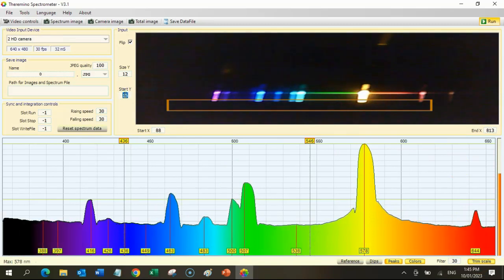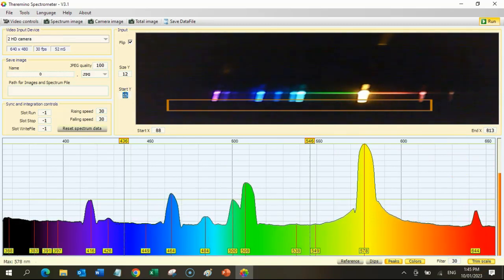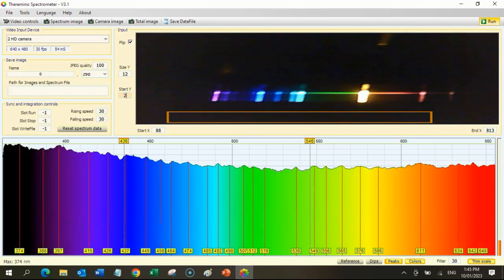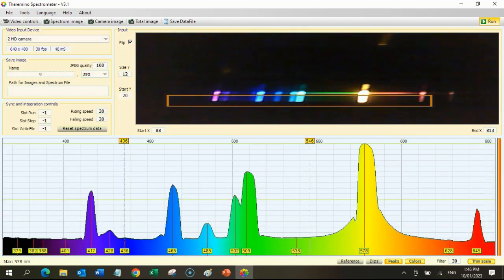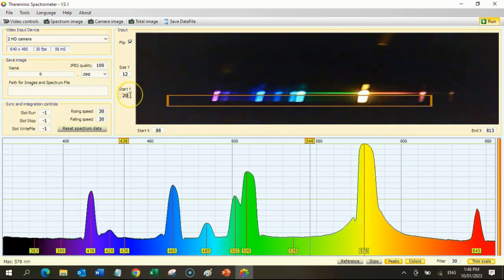Then point the spectrometer at different light sources and draw the intensity graphs for each of those spectra in the workbook.